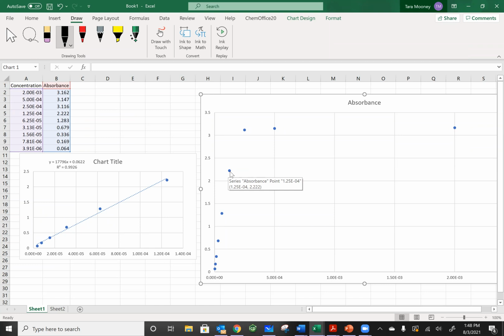So the upper limit of quantification for us is this concentration. If we had more dilutions in between these two data points, we could get something more specific, but we don't. So this is the most accurate we can get for our highest concentration. Okay, thank you.